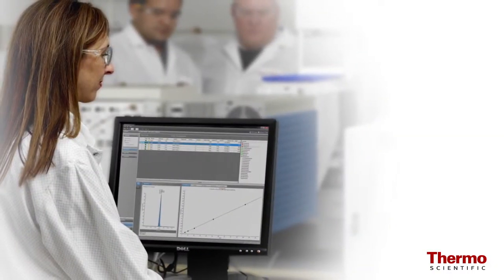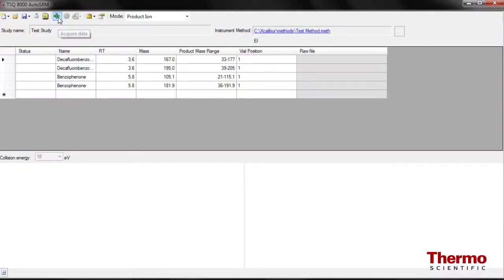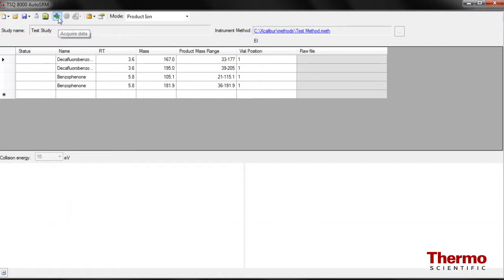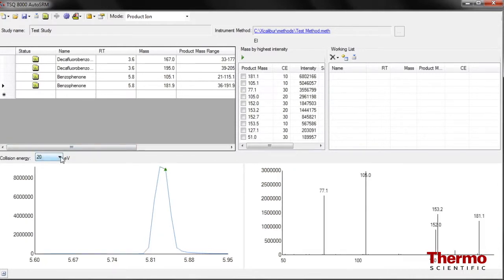The TSQ8000 instrument software makes it the easiest system to realize the analytical benefits of GC triple quadrupole analysis. Newly introduced with the TSQ8000 system is an innovative software feature called AutoSRM, which automates the SRM development process to enable you to add your next new compound to your methodology. You can start from scratch, or begin with an imported single quadrupole method, and AutoSRM will automatically conduct product ion scans and present your best choices for product ions from which to complete your SRM transition.